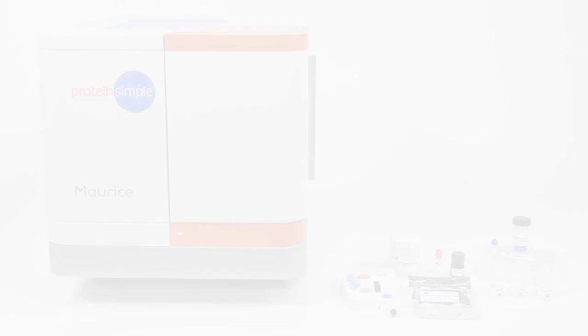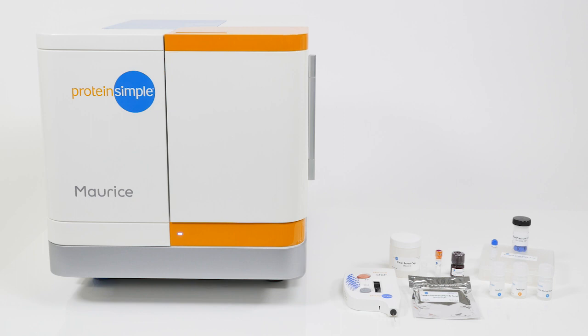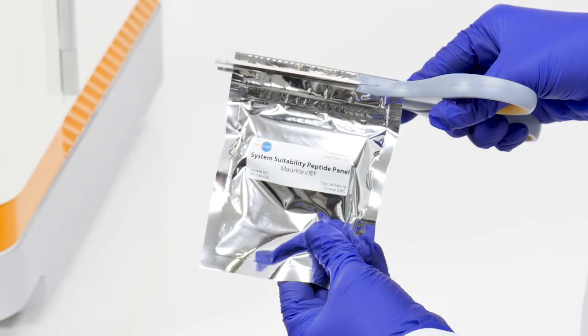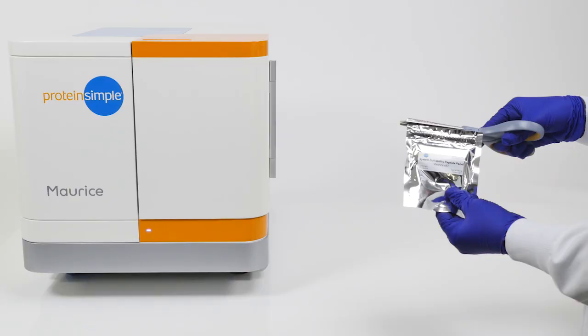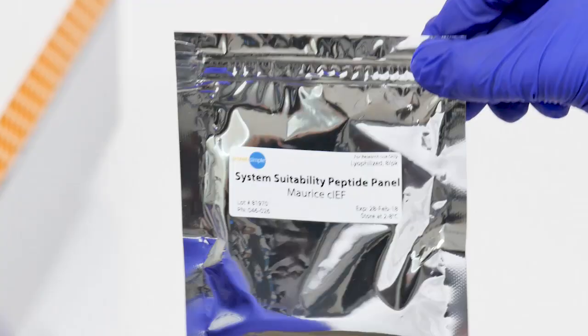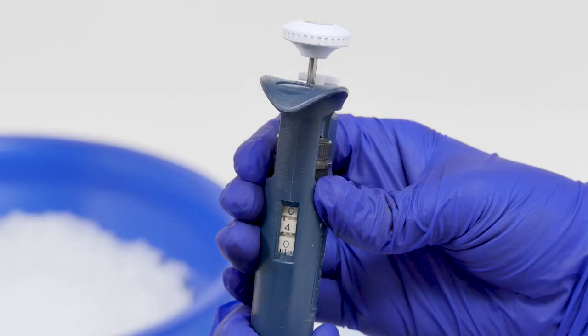To set up a CIEF run on Maurice using the peptide system suitability standard, you will need the items pictured here, which are contained in the Maurice CIEF method development kit. Using scissors, cut open the foil pack containing the eight strip tubes of system suitability peptide and cut one clear tube containing the lyophilized peptide from the strip. Return the remaining tubes to the foil package and return to the 4°C storage.